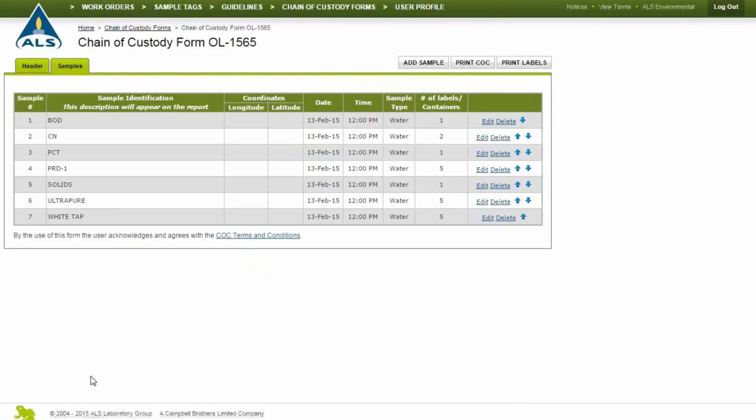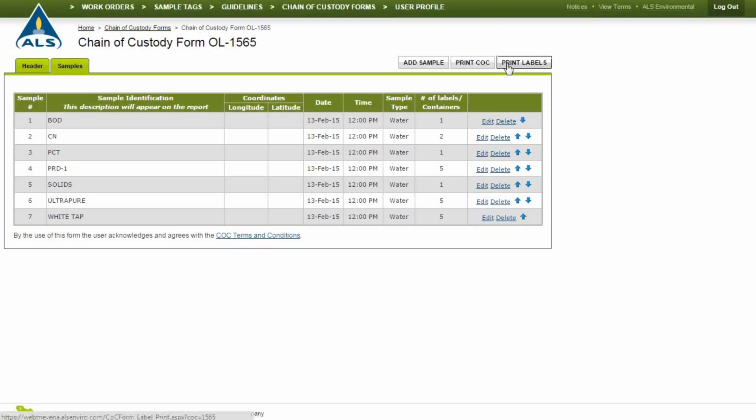Next, click Edit to edit or add samples and analysis requests as needed. Then, click Print CoC to generate a letter-sized PDF. Click Print Labels to print out the bottle and file labels, including the correct number of container types needed.